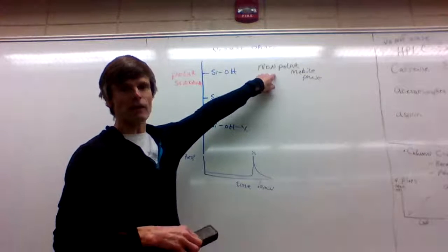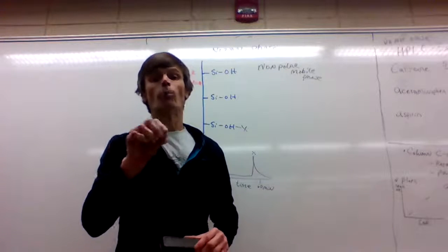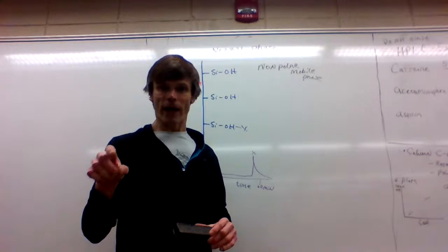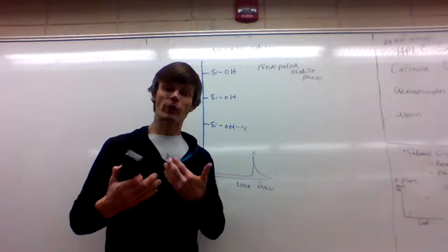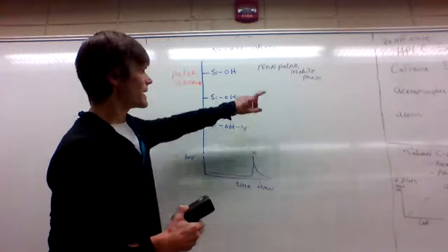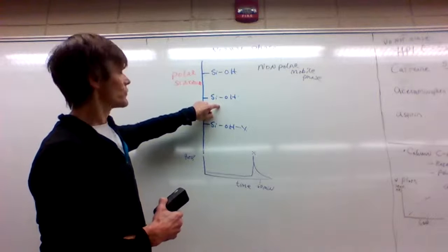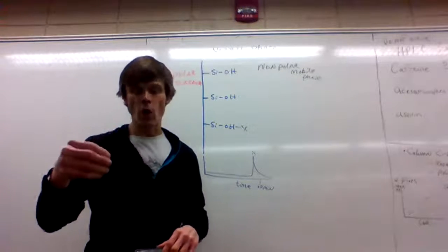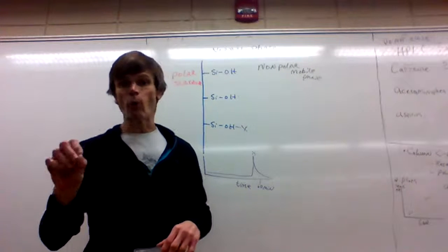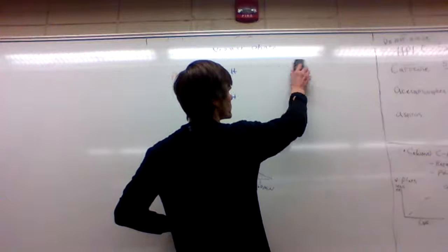I can make this nonpolar mobile phase a little more polar. In other words, I can increase the strength of it. When I say increase the strength, I'm making it more similar or stronger like our stationary phase. So if I make the nonpolar mobile phase a little more polar, so we're going to make this more polar.